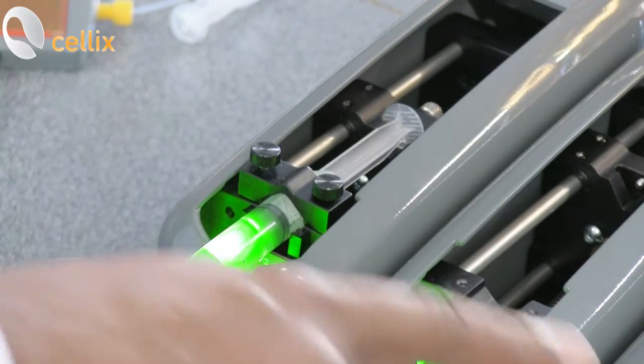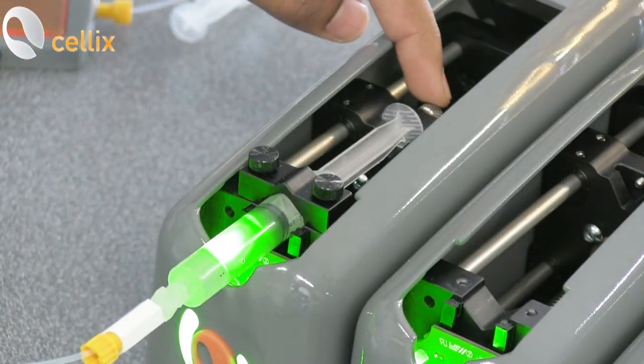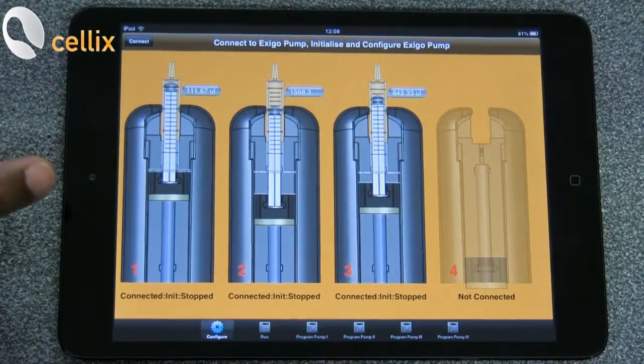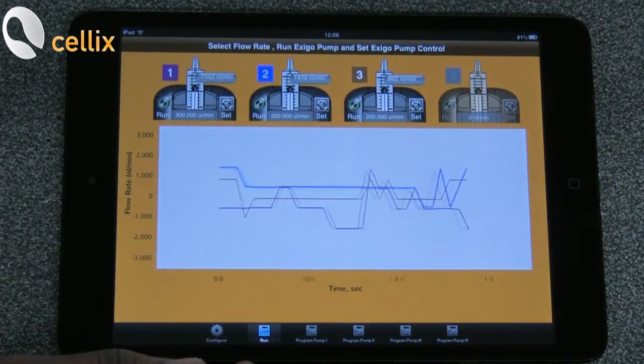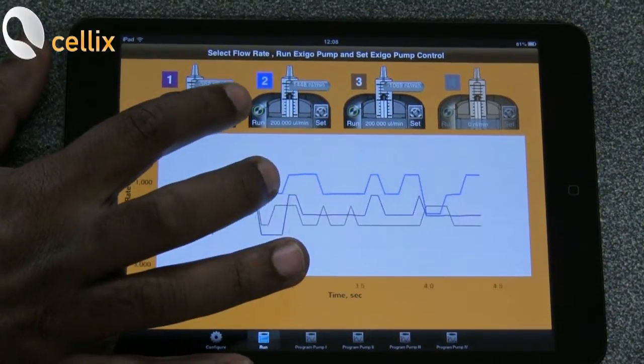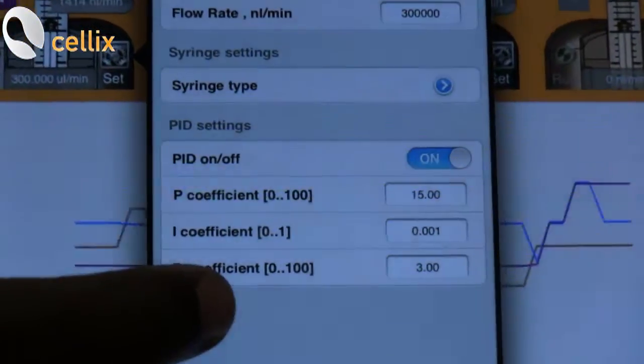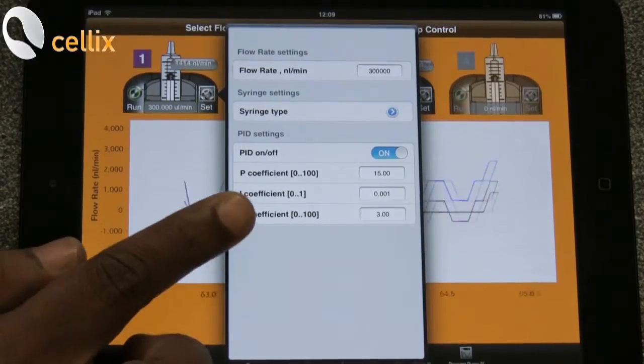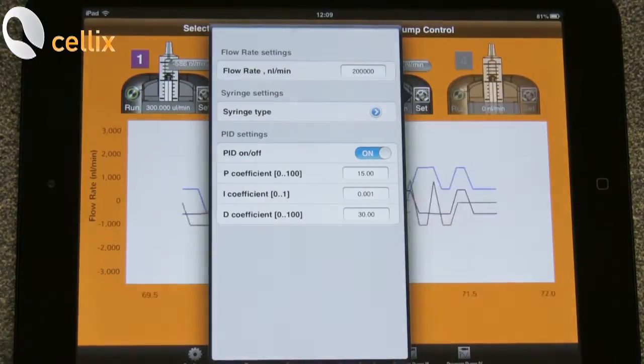Repeat the same step for the other two pumps. This clamp has to be firmly tied on by this screw and the other screw on the back side. Once the syringe setting, everything is done, we will go to the next page, which is the run. And in pump 1, you click the set and you can see the settings of the flow rate and the PID settings. So you set the PID parameters for the next two pumps.